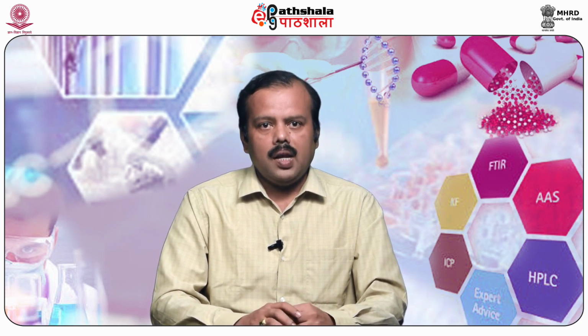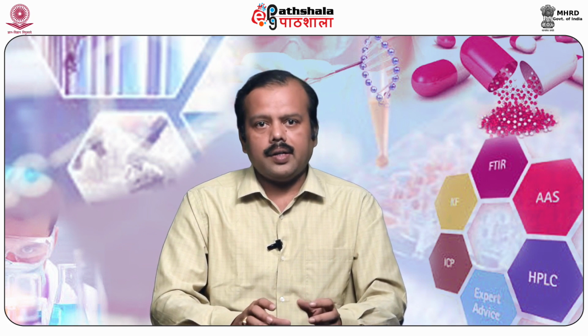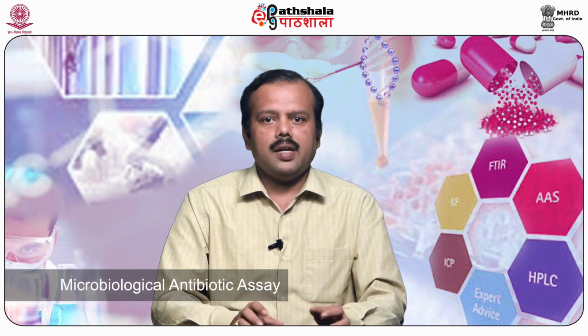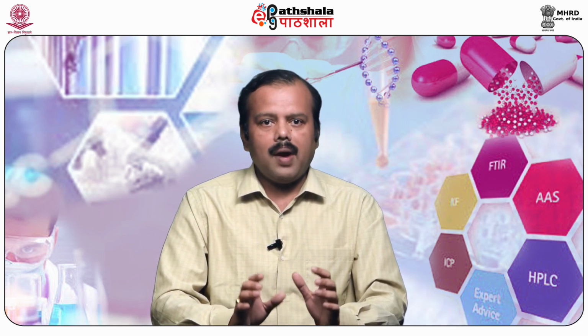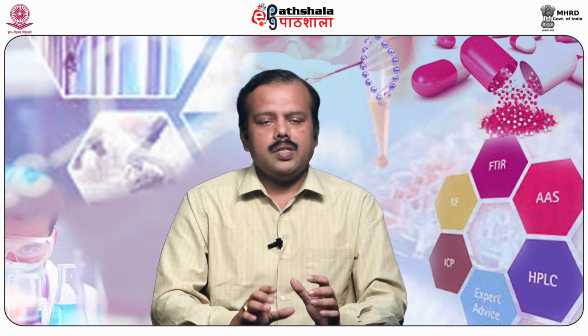So students, let us summarize what we have learned from this module. In order to get correct and validated results, the microbiological antibiotic assay results must be validated by statistical analysis. Microbiological antibiotic assay must be carried out as per the pharmacopoeial method. The standard antibiotic which is used in experiments must be procured from an authentic source.